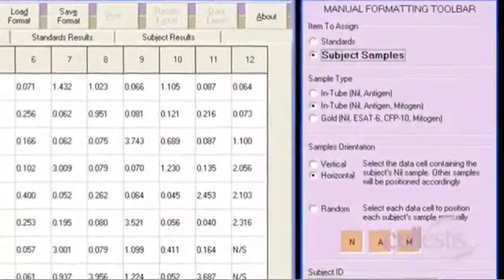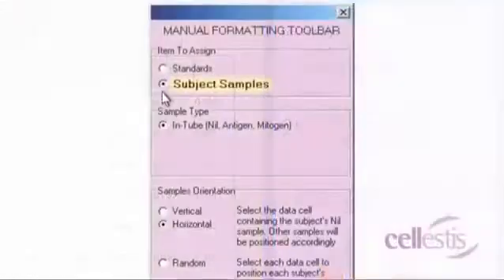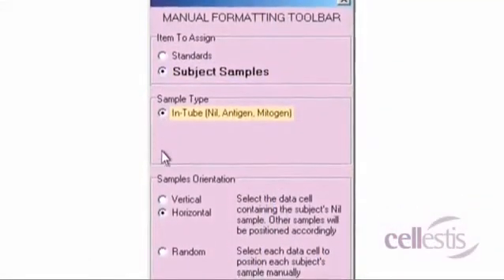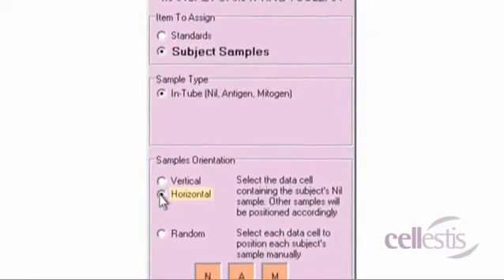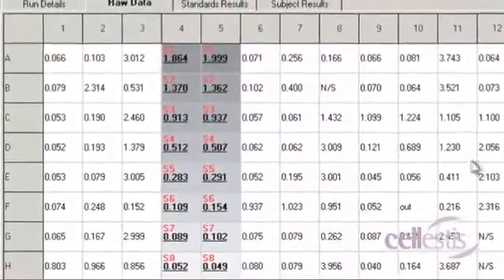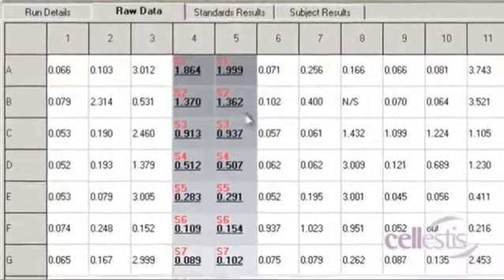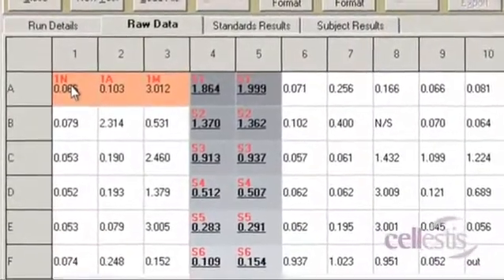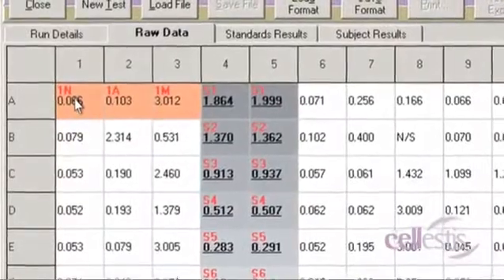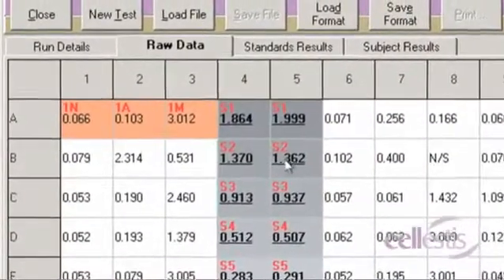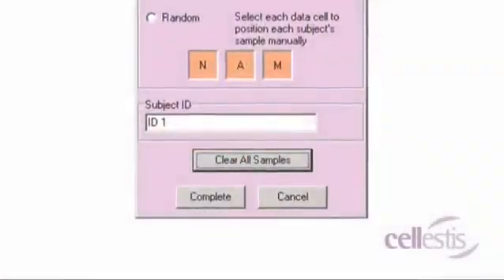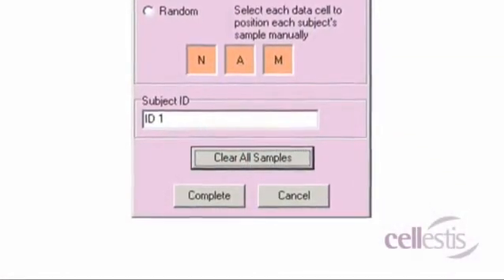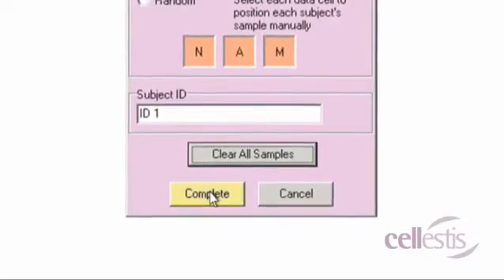To assign subject samples, select the Subject Samples radio button. Select the appropriate sample type and sample orientation. Click on the cell that contains the subject's nil data. The chosen cell will be designated as nil and the other samples will be positioned in order. Once the standards and subject samples have been applied, save by pressing the Complete button.